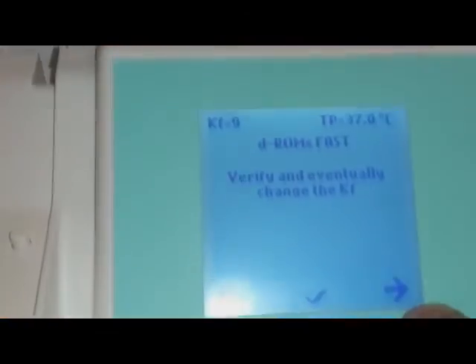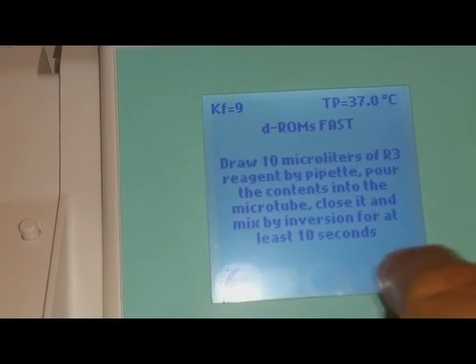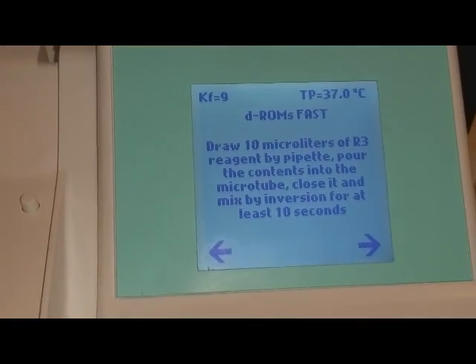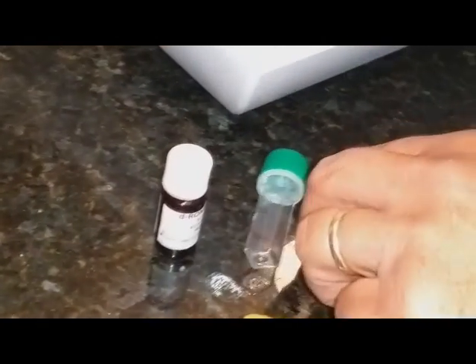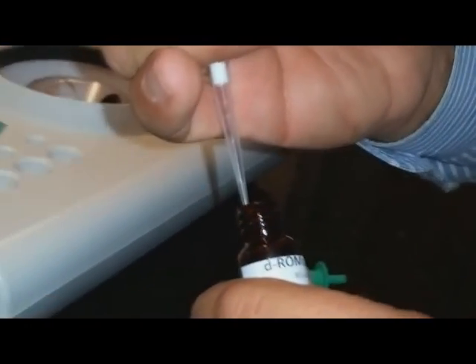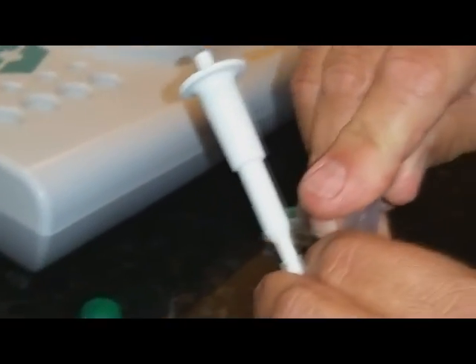That's correct. Now we're going to proceed. I'm going to get 10 microliters of the R3 reagent using the micropipette. This is a 10 microliter suction device — we put on our little pipette. Here is the R3 reagent and we're just going to suck up 10 microliters. You can see I've got a little bit of fluid in the base of my pipette.